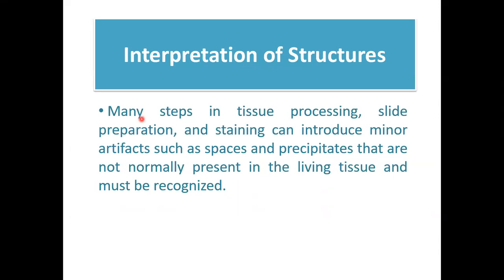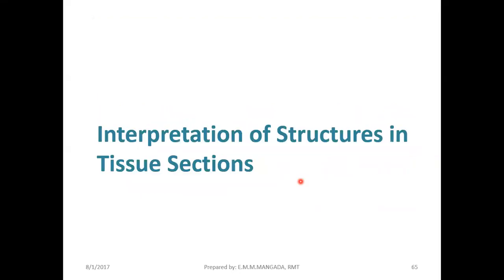So interpretation of structures, sa ating mga medical technologists, we do not read yung mga slides natin. Okay? Ang gumagawa niyan lalo na in cancer diagnosis ay yung mga pathologists natin. Okay? So they usually do the reading. Okay? So those are the different methods of histology.